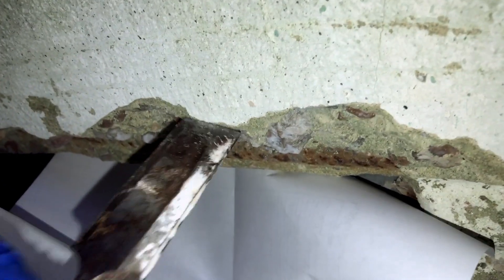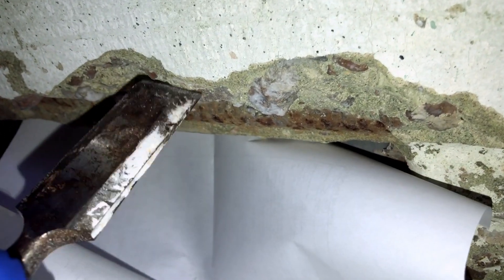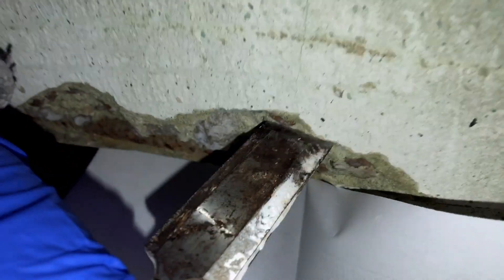This is how we take a sample for asbestos. We're chipping off concrete into this sheet of paper. We're trying to collect large pieces, not dust — as large as possible, but we cannot exceed one inch. There's a nice piece right there.